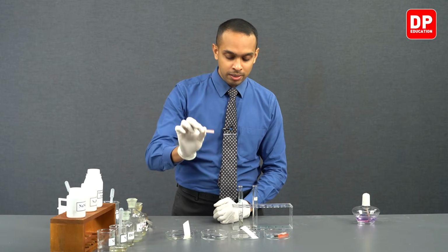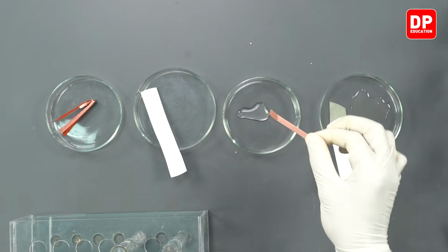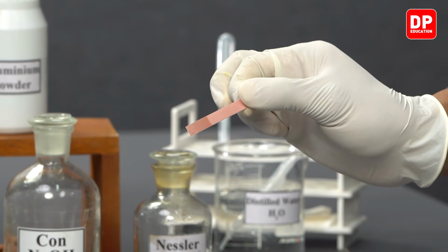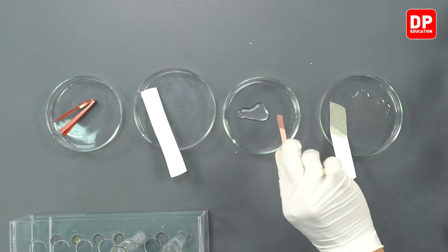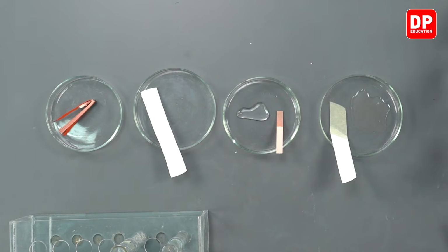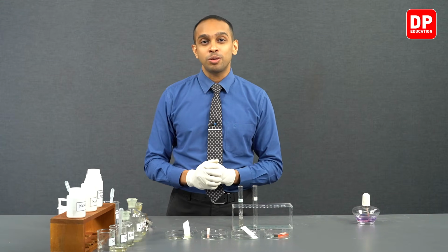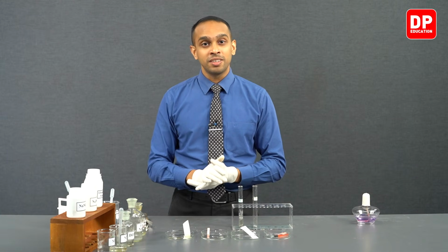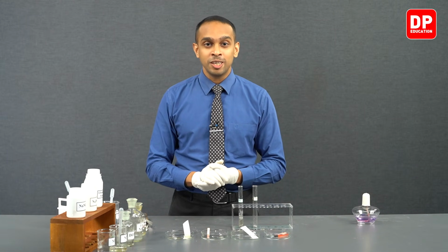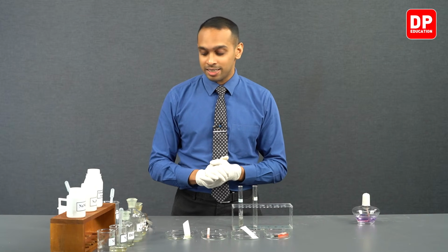And I'm going to take a red litmus paper, make it wet with a little bit of water, as you can see here, and we will leave this red litmus paper here also on the side. So as ammonia gas is produced, we are going to use these two filter papers, the Nessler's reagent paper and the red litmus paper, to confirm the formation of ammonia gas.